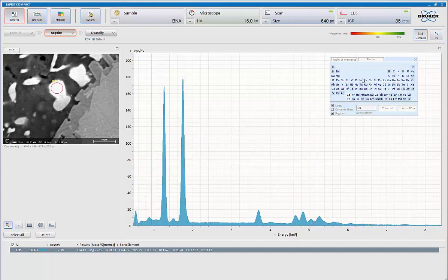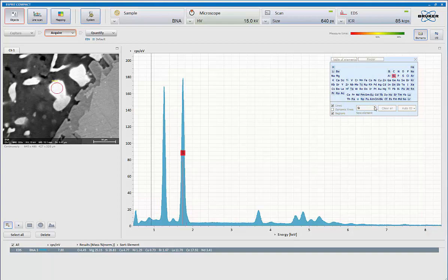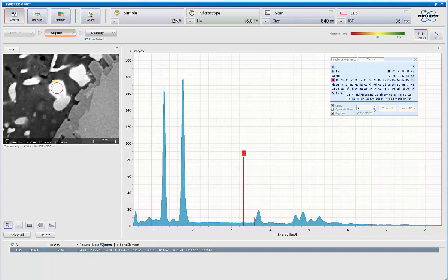At this point, I can simply click on any KLM marker, bring it up onto the display. Again, utilizing this tool, I can move it up and down an atomic number, following the basis of Mosley's Law.